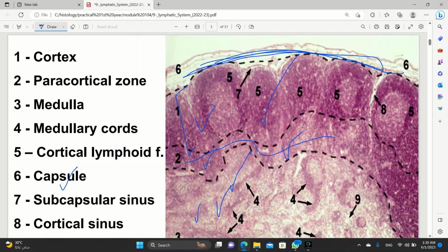Okay, these ones are some sort of follicles. Those are the lymphatic follicles or the cortical follicles. And they are secondary, by the way. What's between them is the trabecular sinus, or you can say cortical sinus. What's important is that it's a sinus, because you will find out after some time that the trabeculae were colored and the sinus was white. And I can prove that to you right now.